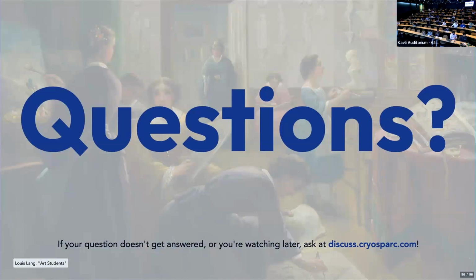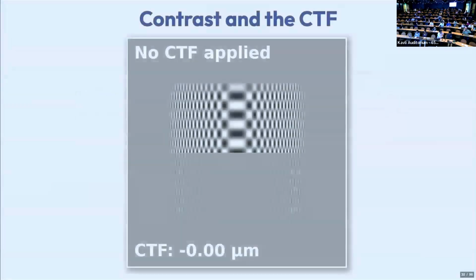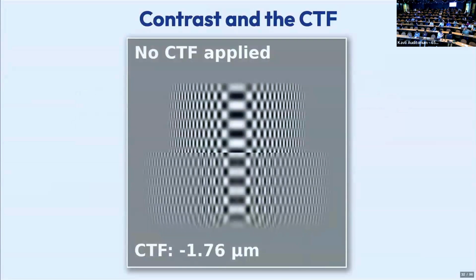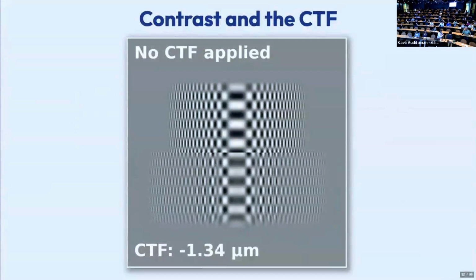We do have a question from the Zoom people. Two questions, and I think they can be combined into one the way it's written. First is, how big should the box be around the particle to get that contrast? And does this change with larger particles versus smaller particles? Is twice as big good one way, but 3 times as big is better the other way? And the other question is, why does the high resolution stuff move out?